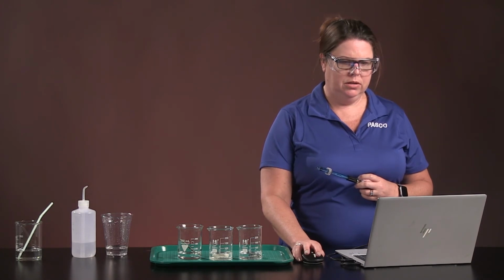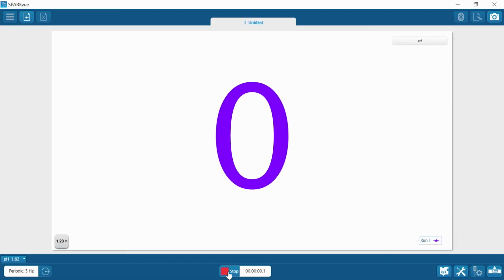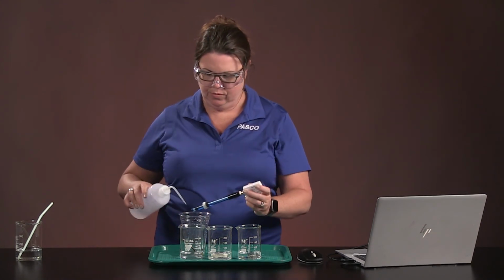All right. Okay, let's try the nail first. We're reading at 1.82. Okay, rinse that off.